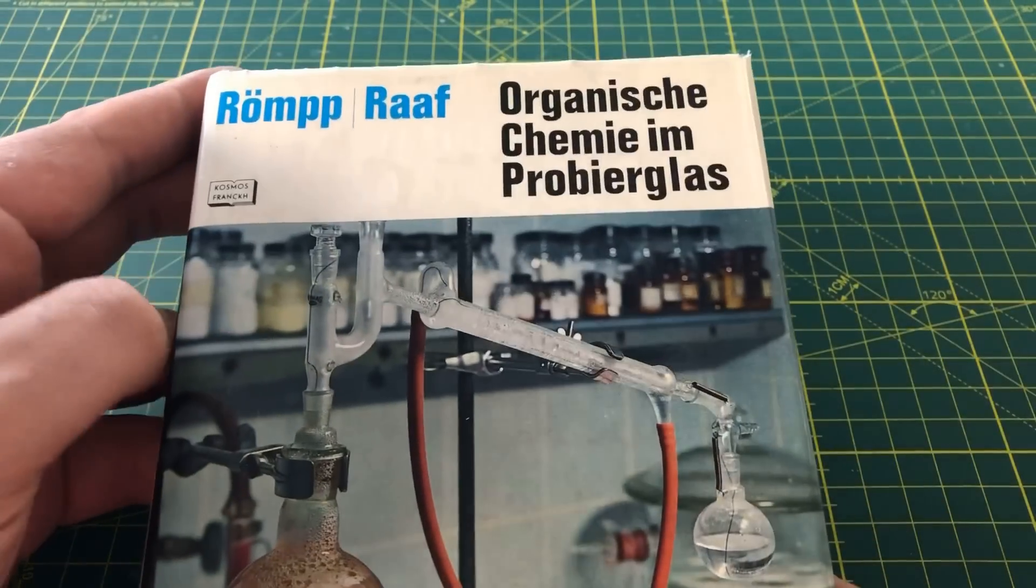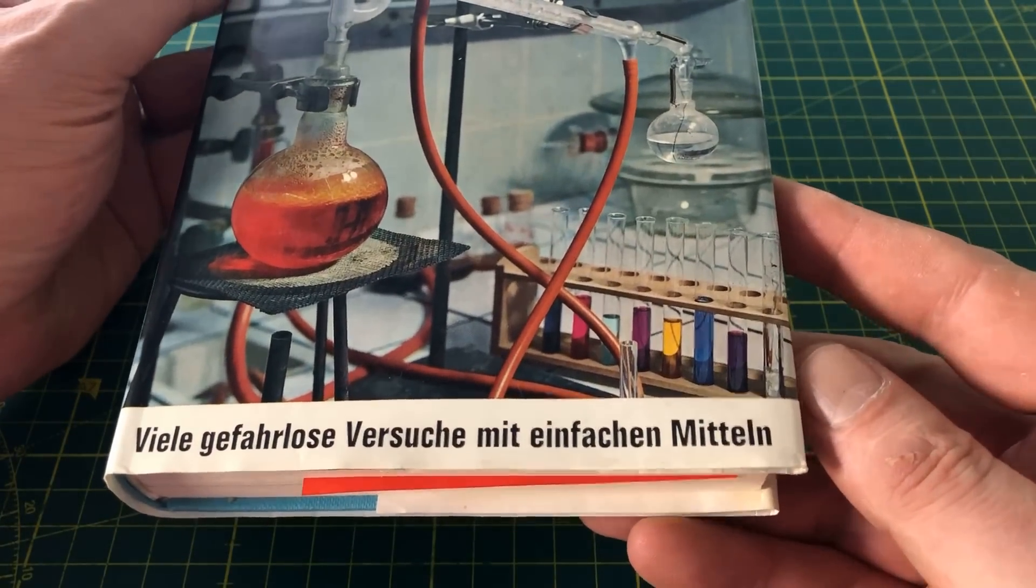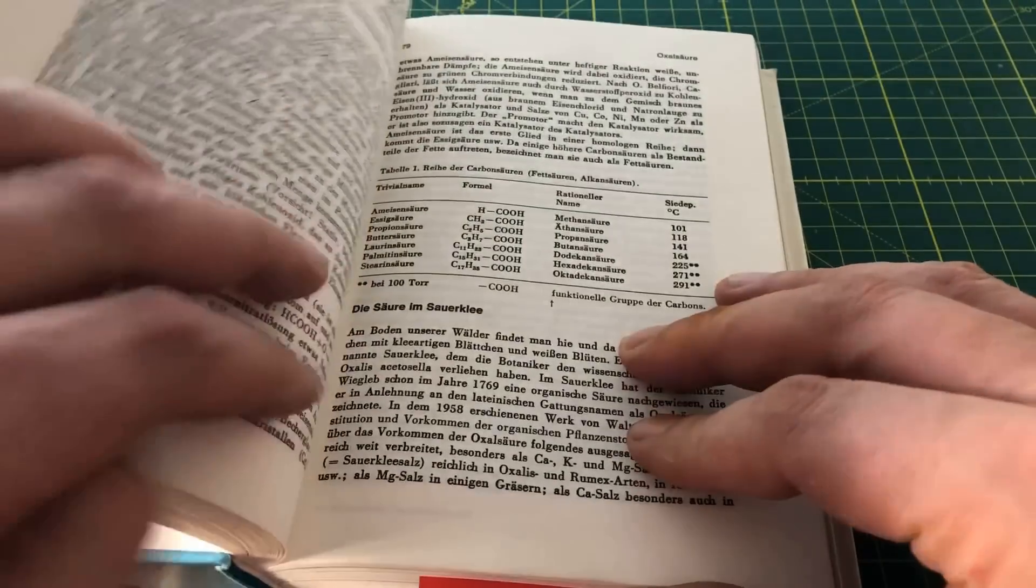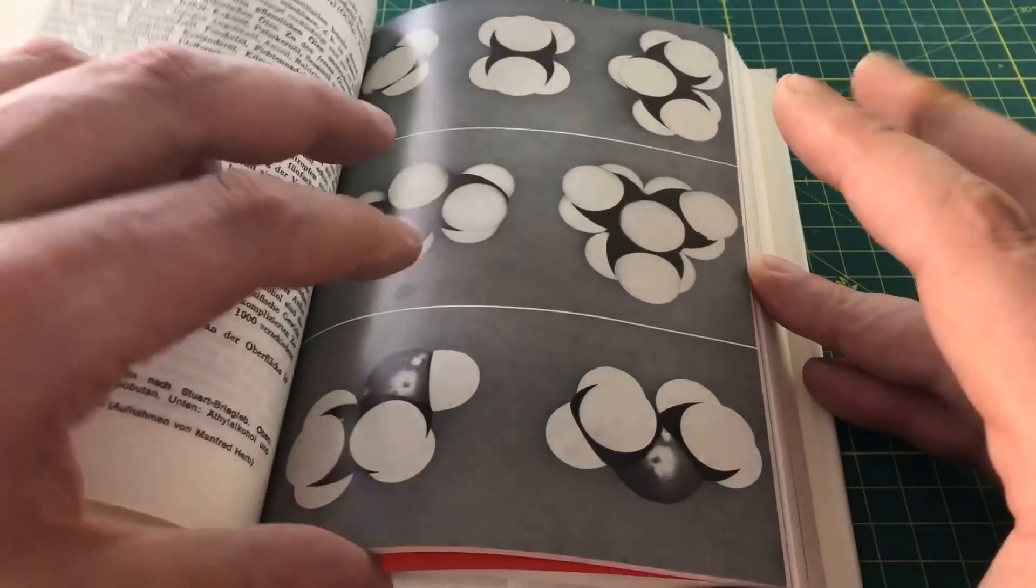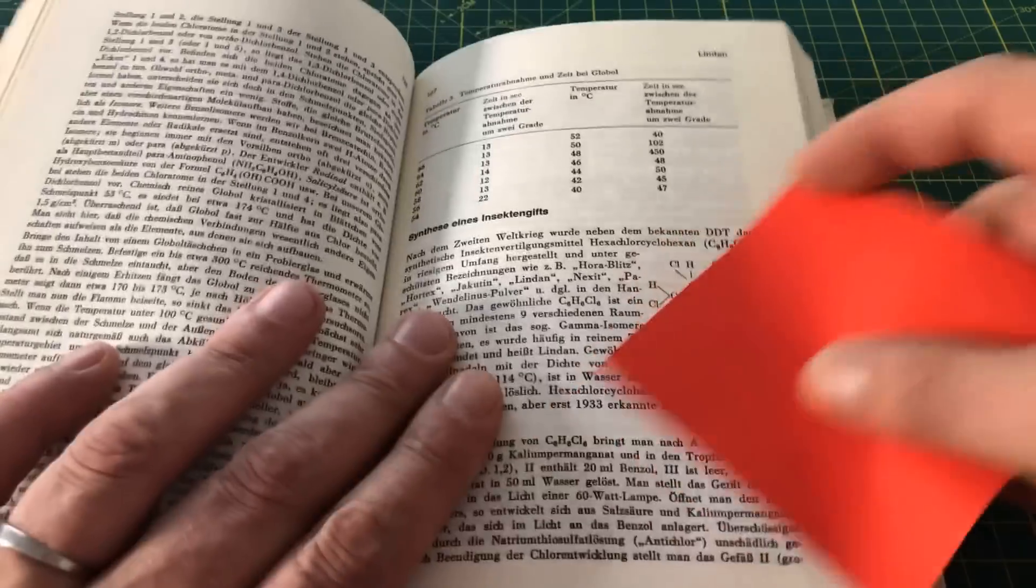I have owned this chemistry book since I was a teenager. Over time, I have replicated all the experiments in the book, except for one: the synthesis of an insecticide, namely lindane, also known as gamma-hexachlorocyclohexan.